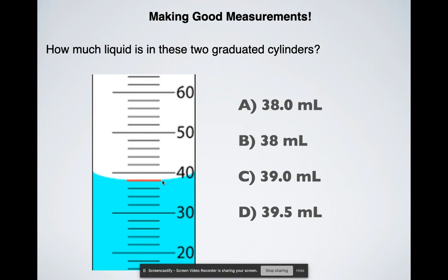So I need to at least give you my estimation and so I would say this is exactly on the 38 and so you might think oh yeah so B, 38 milliliters, no. So the way that estimations work are that you would include that estimation in your value so it'd be 38.0 milliliters and the reason why is because I know these lines with certainty so I would give you my A here as being the correct answer. Technically none of the other ones would be correct because this is exactly on the line.